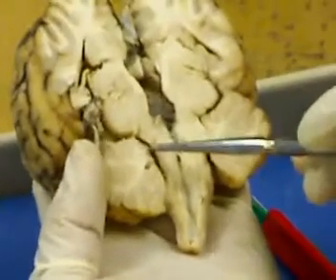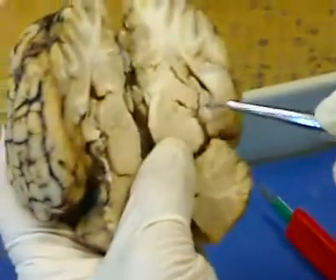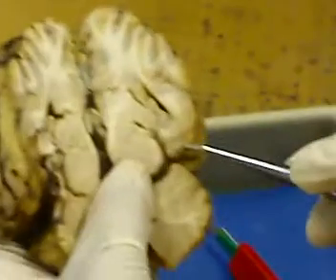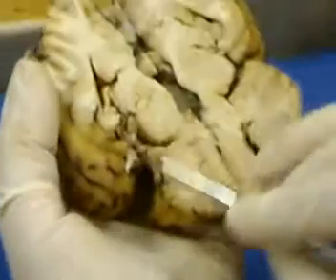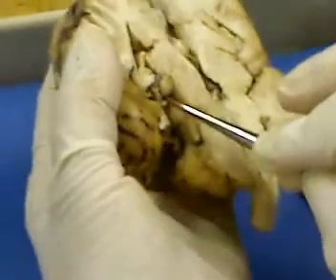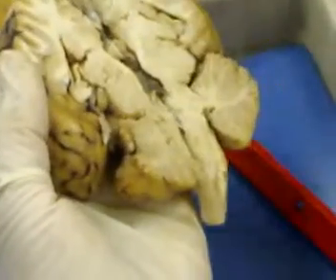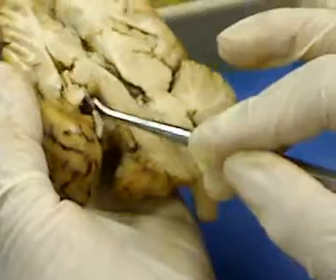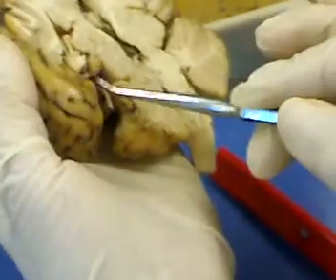Then pineal body. You look at the corpus callosum, and at the back of the corpus callosum there will be a round structure which is the pineal body. That means my section has not gone exactly through the middle, and the pineal body sometimes comes on one side. It has come on because these threads came out. So yes, this is the pineal body. It has come all the way here. My section is a little bit gone to the right side, and the whole pineal body has come on this side. But in your sections, you might get the pineal body half on this side, half on the other. Okay, this is pineal.